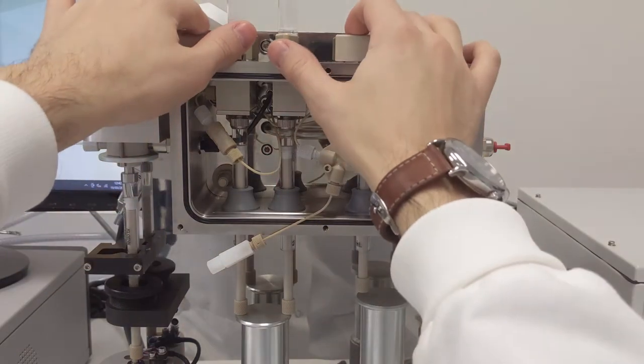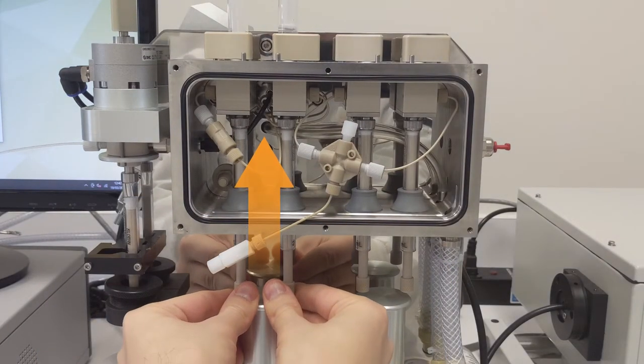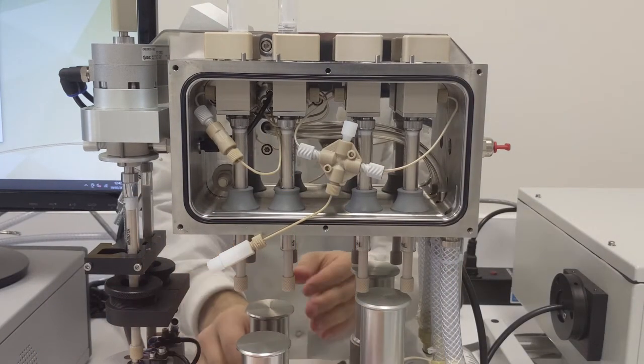Syringe removal is done like this. First, make sure that there is no residual liquid in the drive syringes by pushing them upwards with the drive valves in the load position.